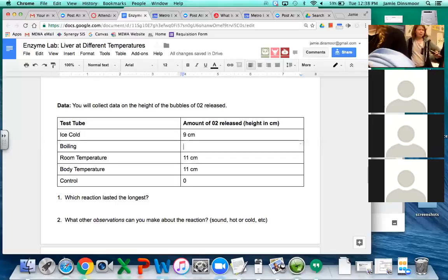Okay, we need 5 more milliliters of the hydrogen peroxide. We've got to do this quickly. Yeah, I can smell it now. Oops, sorry, can't see the edge here. Oopsies, making a big mess. All right. Okay. Ready?